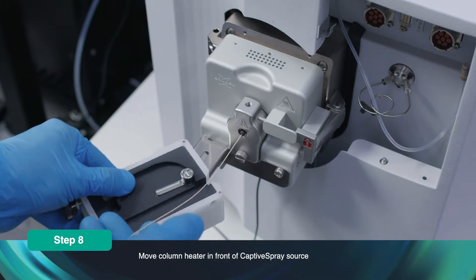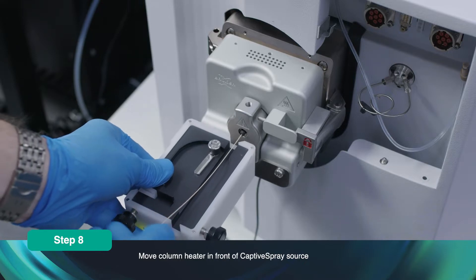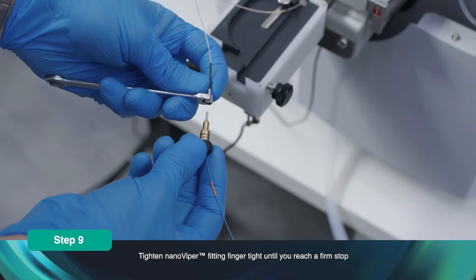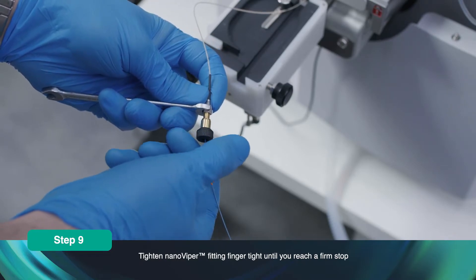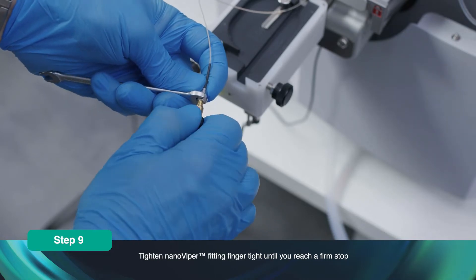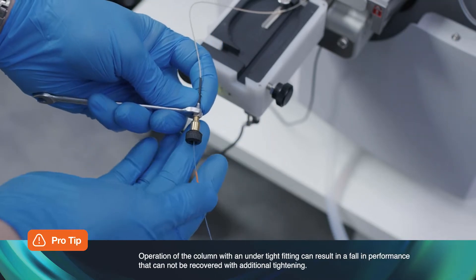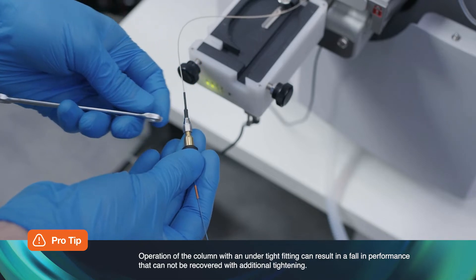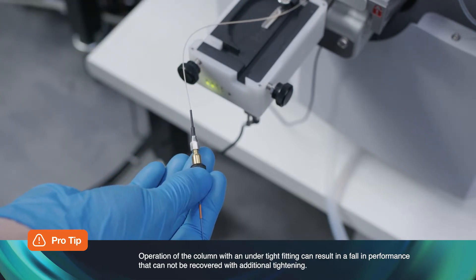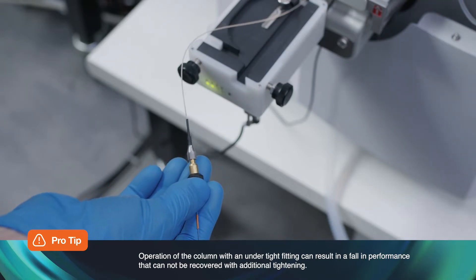Move the column heater in front of the captive spray source. Hold the Nano Zero with a spanner and tighten the Nano Viper fitting finger tight until you reach a firm stop. Operation of the column with an under-tightened fitting can result in a fall in performance that cannot be recovered with additional tightening.